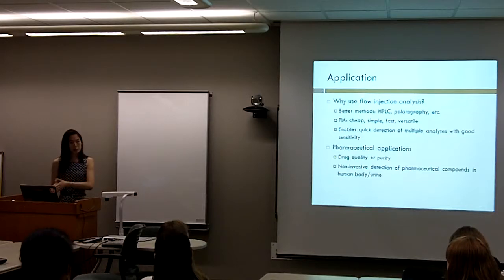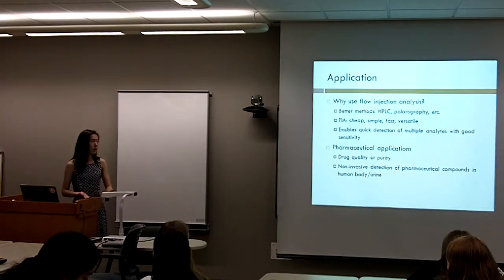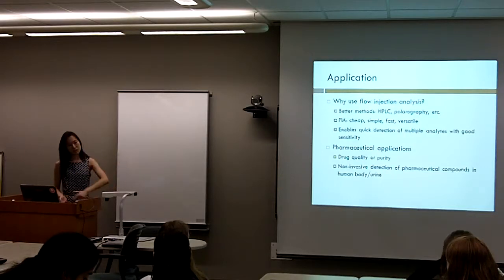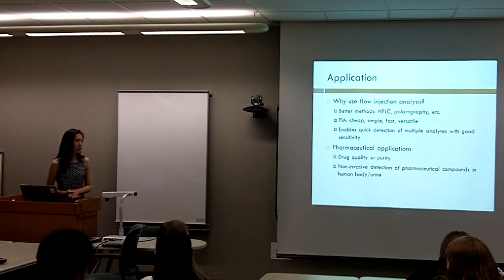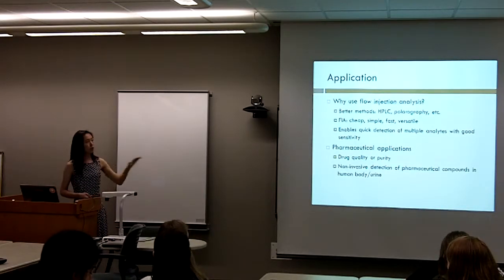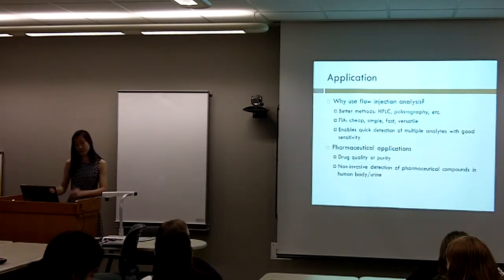It's extremely cheap, it's simple, so someone without an extensive scientific background would still be able to operate it. It's very fast because you have that continuous flowing stream, so there's no need to clean. And it's very versatile. It can be made out of a variety of different materials. So because flow injection enables quick detection of multiple analytes with very, very high sensitivity, it's a good method, so we should study it.